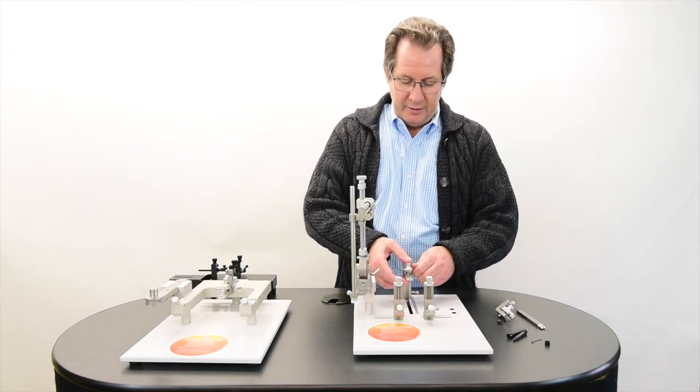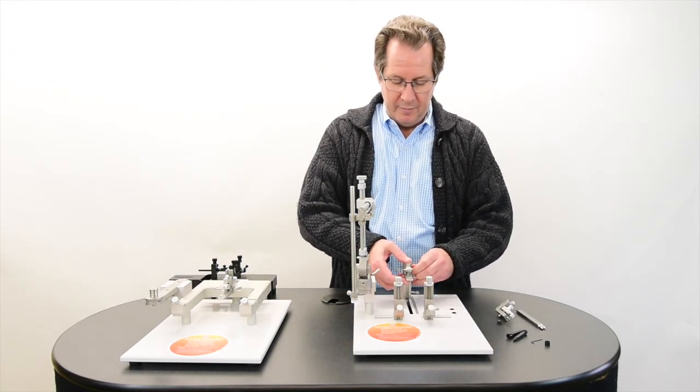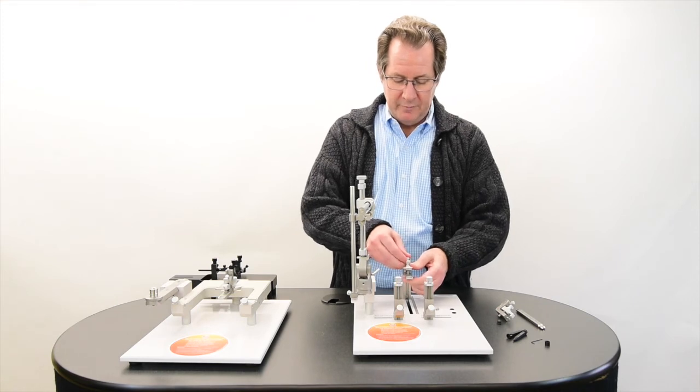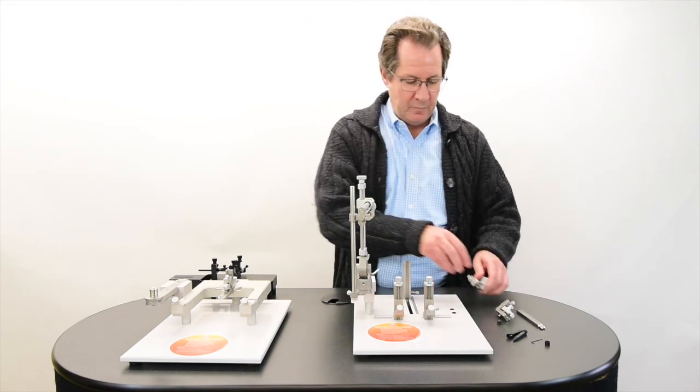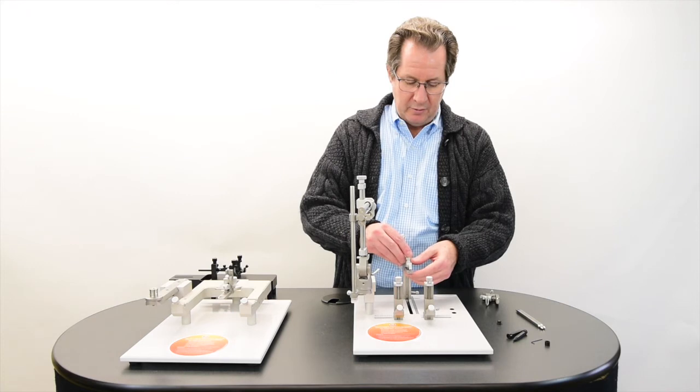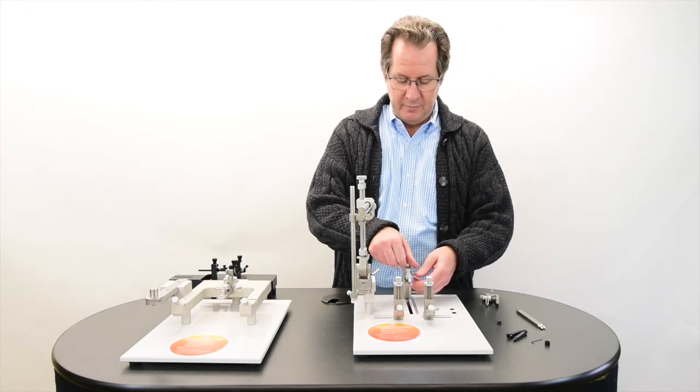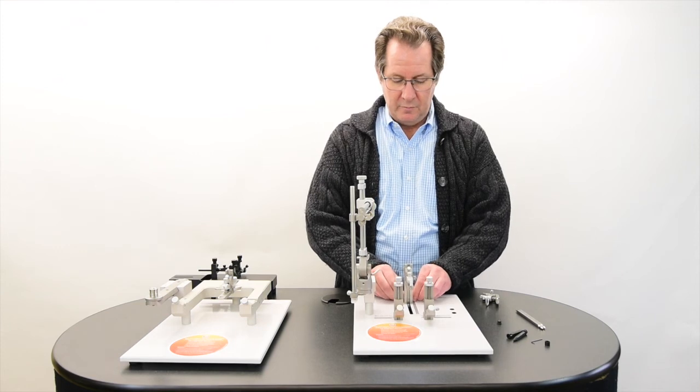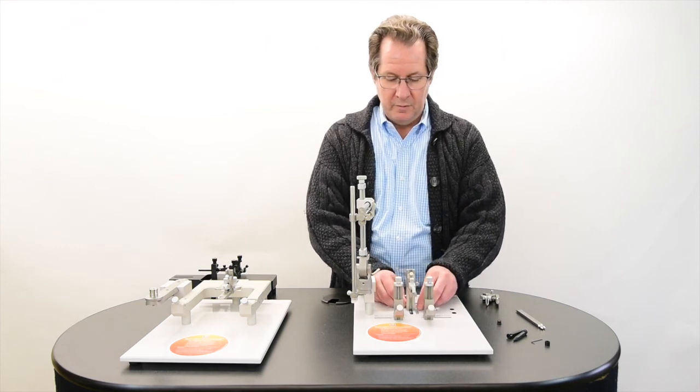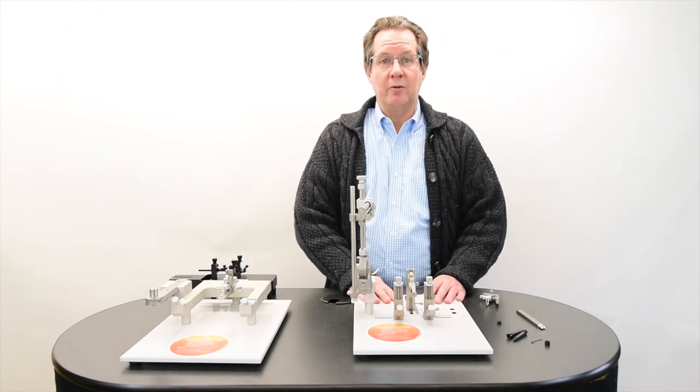And then the other part is to simply remove the rat adapter from the vertical post and simply now all you have to do is place the mouse adapter, tighten it down forward, and now you're ready to go for mice.